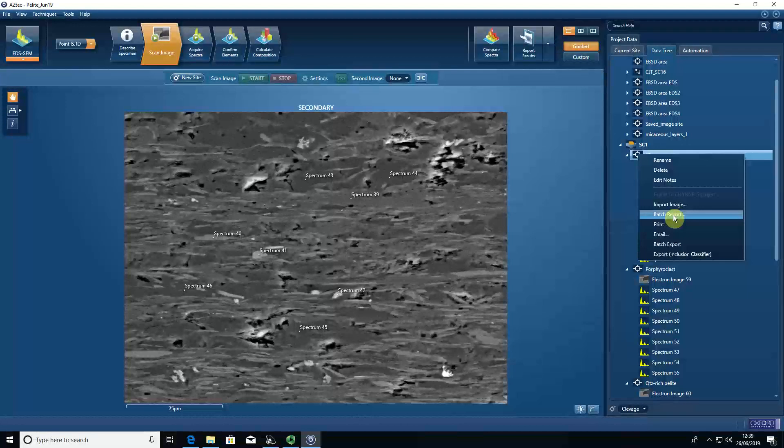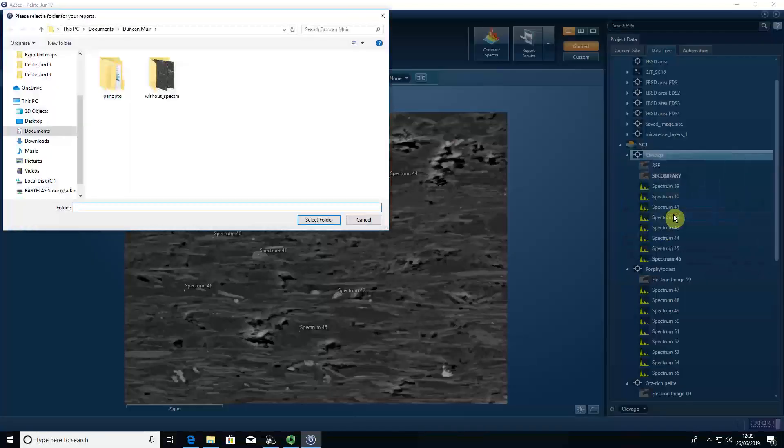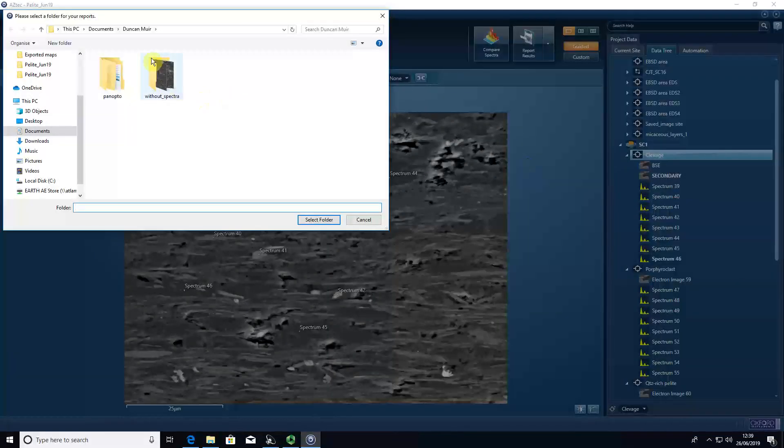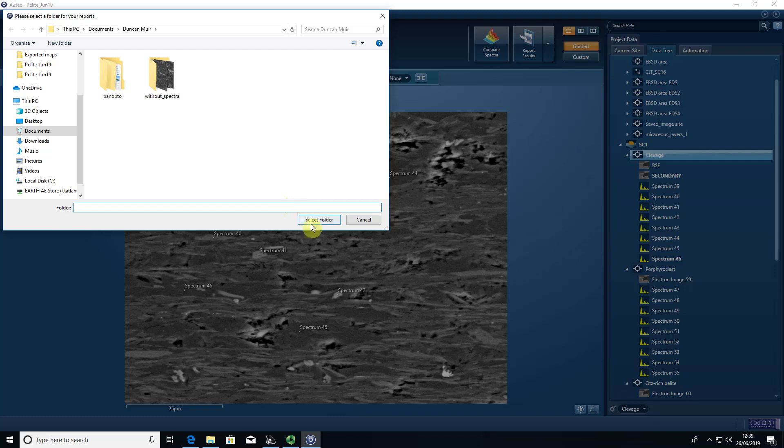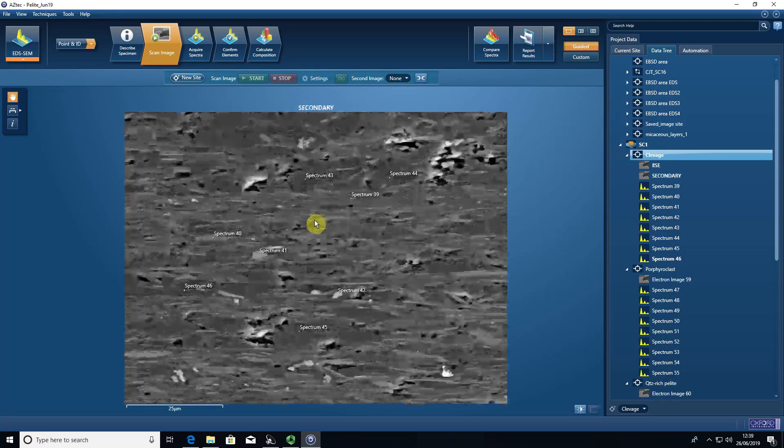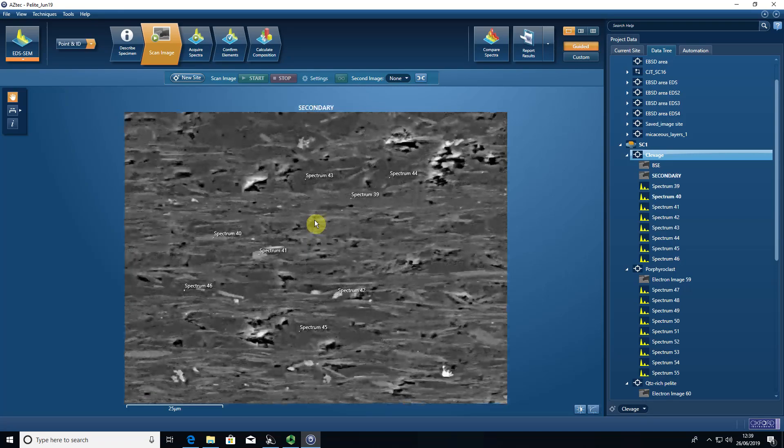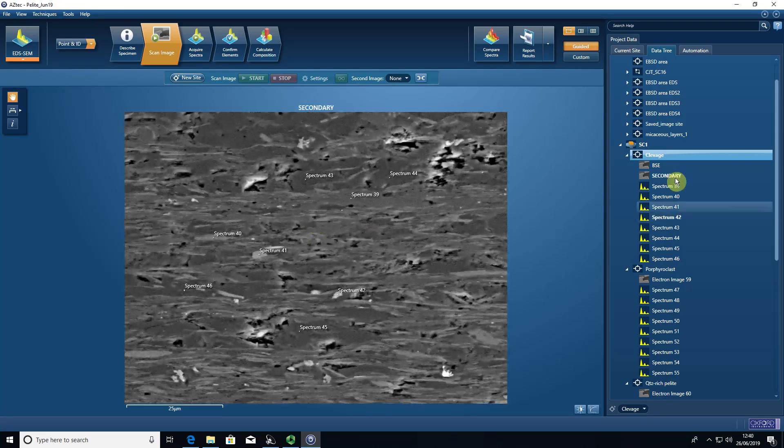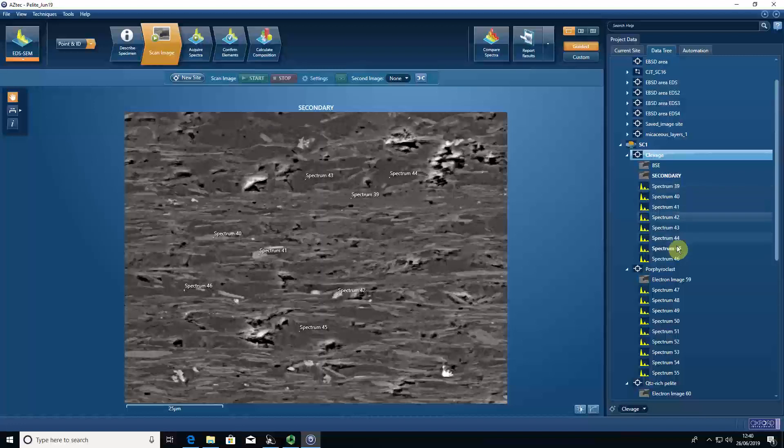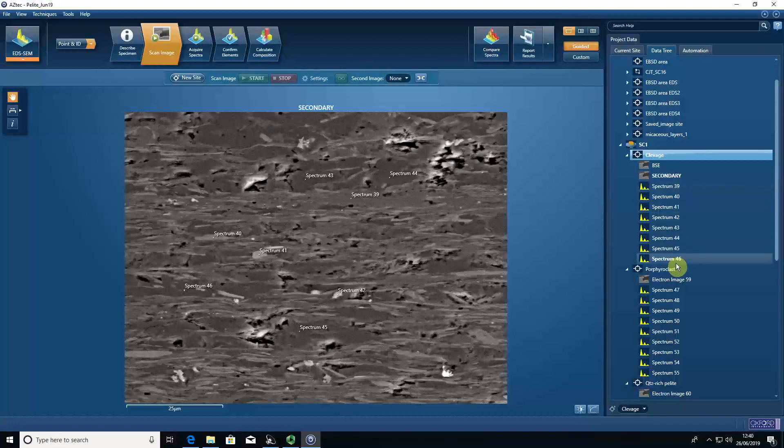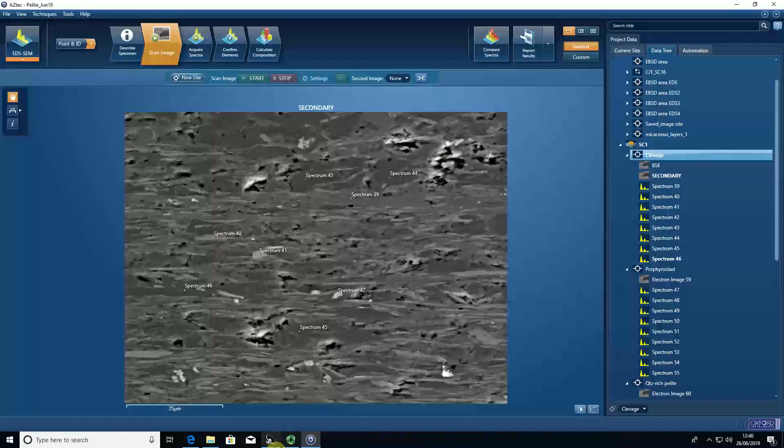If you press batch report and select the folder that we want to save the Word document in, the software will then run through that site and order the spectra.